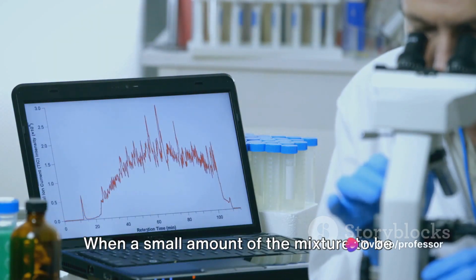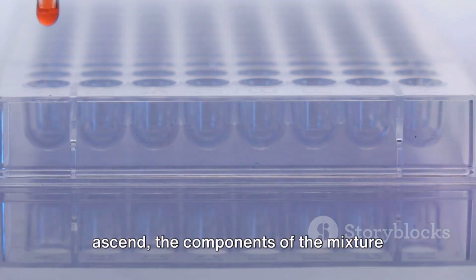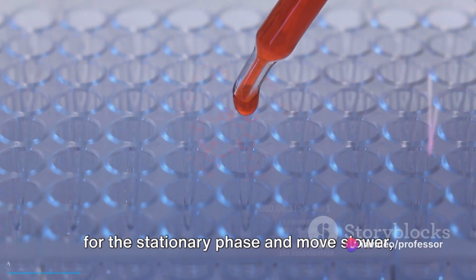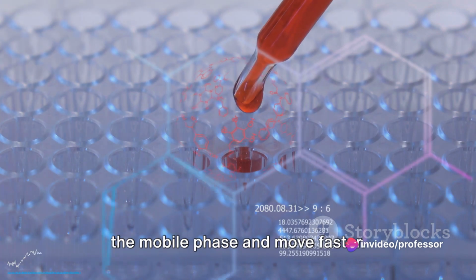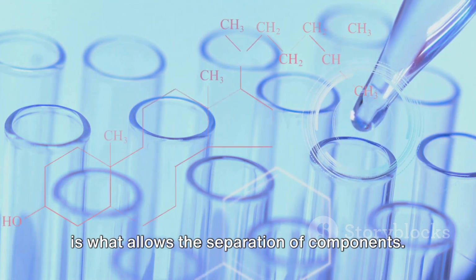When a small amount of the mixture to be separated is applied onto the stationary phase, and the mobile phase is allowed to ascend, the components of the mixture start to move. But they don't all move at the same pace. Some components have a greater affinity for the stationary phase and move slower, while others have a greater affinity for the mobile phase and move faster. This differential movement, or migration, is what allows the separation of components.